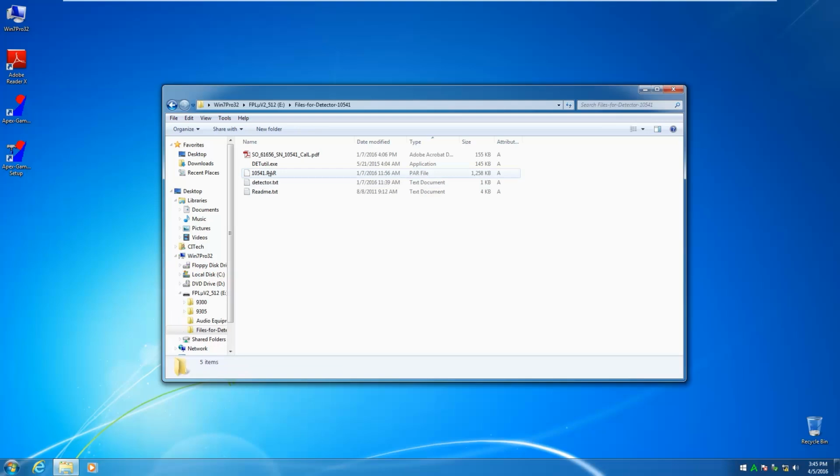All PAR files must be copied to a specific folder location to be usable within the standard Genie 2000 software. In addition, a file named detector.txt must be edited to include a unique link to each PAR file and to allow selection of characterized detectors when using a Geometry Composer application.